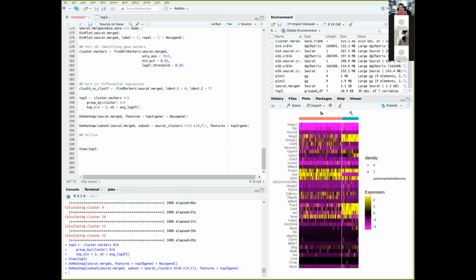Last one that I use recently is called URD. I like this because it identifies gene programs. So instead of looking at just one gene and seeing how it changes, it groups genes together as a gene program and tells you exactly the list of genes in each gene program. It's quite interesting actually. Other analysis that you can actually do, like I said, trajectory analysis using Monocle. If you're into that, depending on the request, I can try to do trajectory analysis in the future if you want that. If not, the vignette is actually very easy to follow.